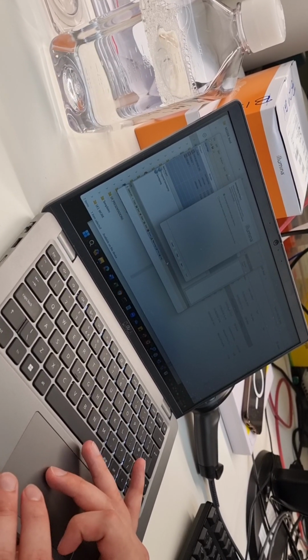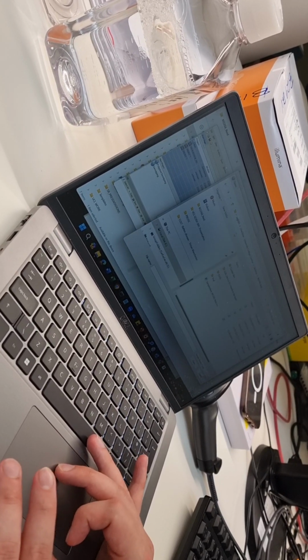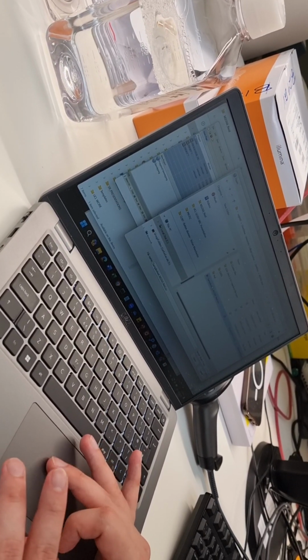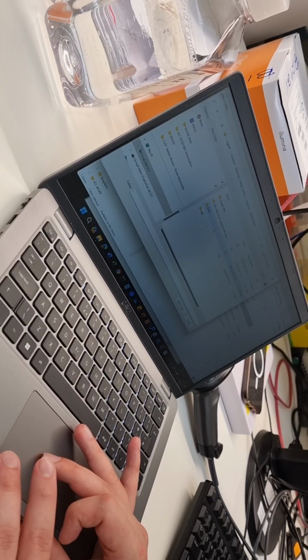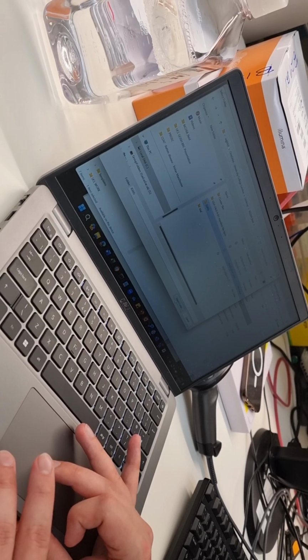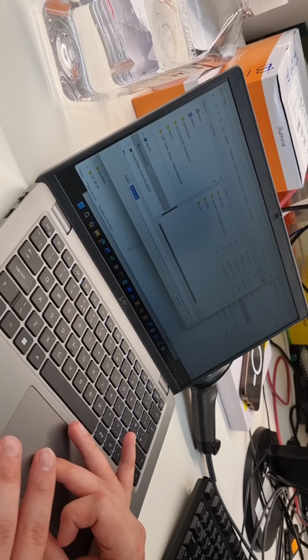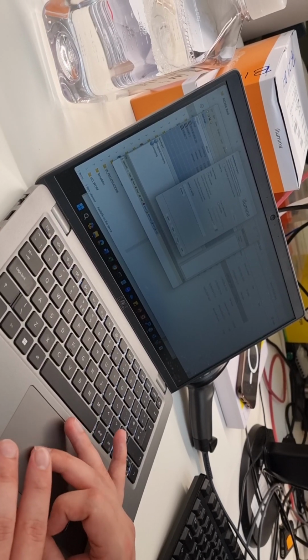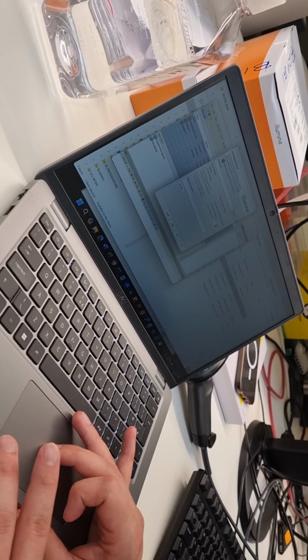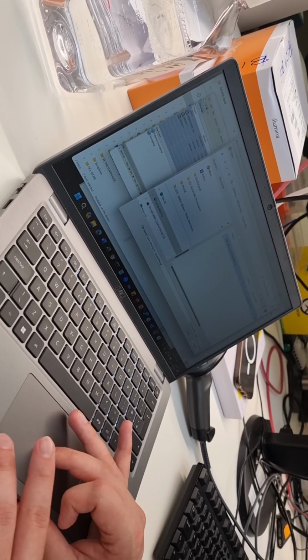You use the sample sheet to load up sample intensities. Next. And then the sample sheet is, just click that one. The data repository, that's your IDAT file, so just select that one. And then the manifest. Your manifest is just this folder here. Then you press next. And then import cluster file, then cluster files, and click on the EGT file.